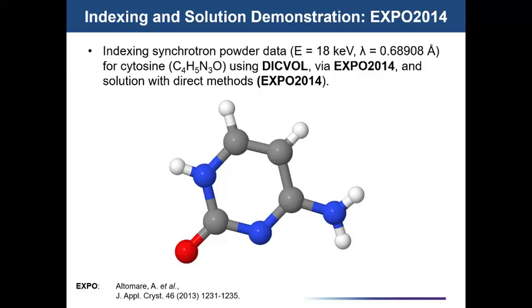So the second thing is, if we look at this, it's basically got our molecule in the right setup, right? But if we look back at the actual molecule, I'm going to switch back to the main PC for a sec, if it'll let me. The nitrogens aren't in the same position. So one atom is at least swapped. This third nitrogen was right here in our solve method.